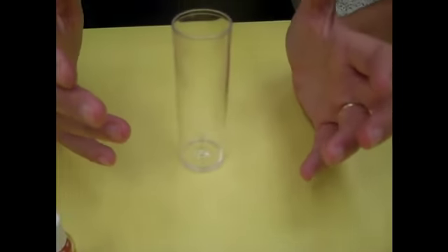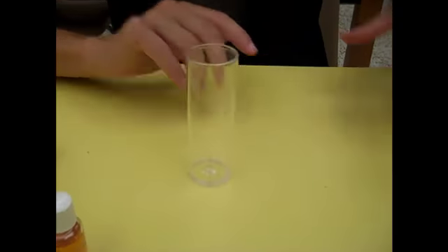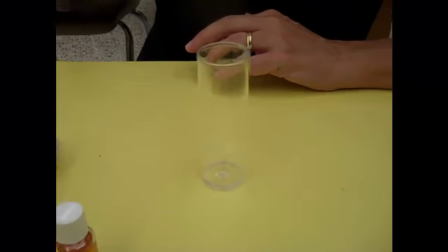So I'm going to set that aside for a minute, and while we're doing that, I want you to see how you set up a new culture vial, because sometimes we want to put some of the flies that we've put to sleep into a new culture. So I'll show you how to do that.